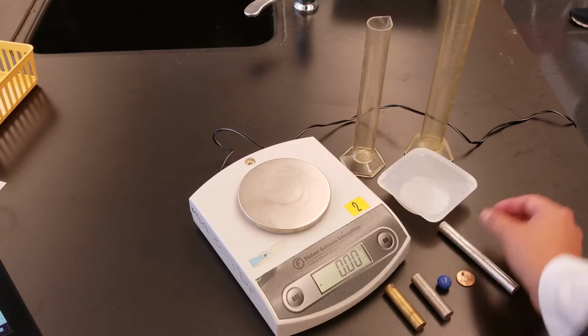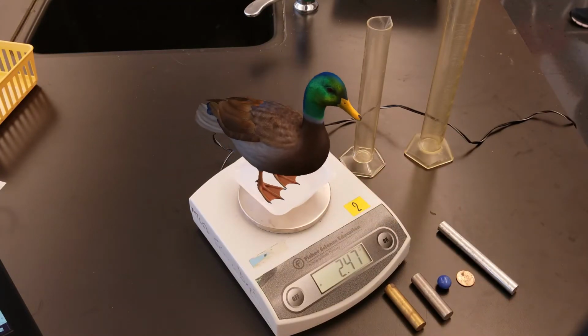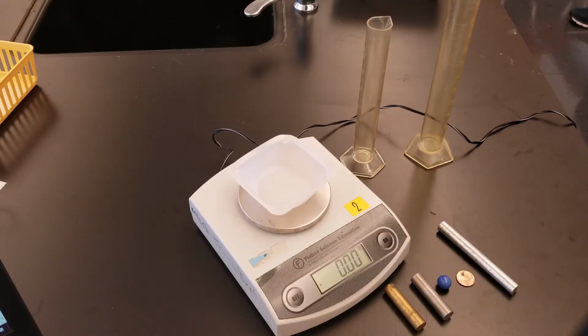Let's find the mass of each object. Because these items can roll, I'm going to put a weighing boat on. The weighing boat has mass, so I'm going to zero the device. It now reads 0.00 grams again.